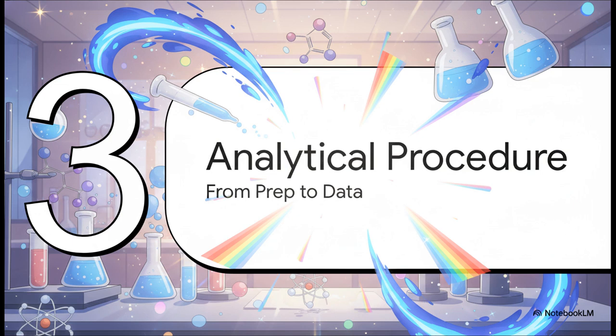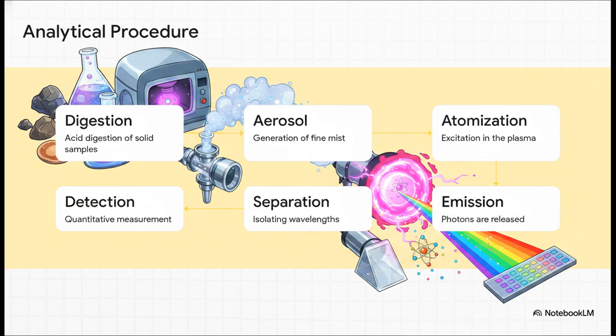Section 3. The analytical procedure, from prep to data. So how do we actually pull off this chemical magic in a day-to-day lab routine? Well, it all starts with sample prep, which is absolutely critical. We can't just toss a rock or a piece of food directly into the nebulizer, right?